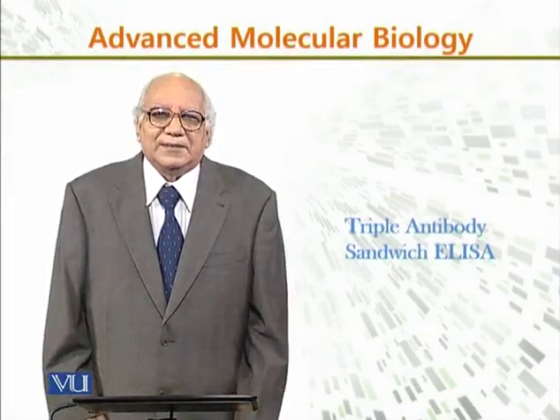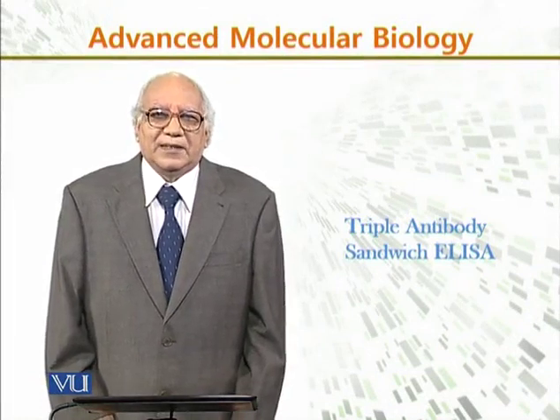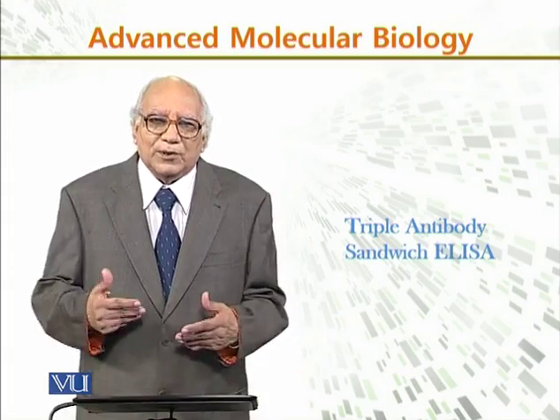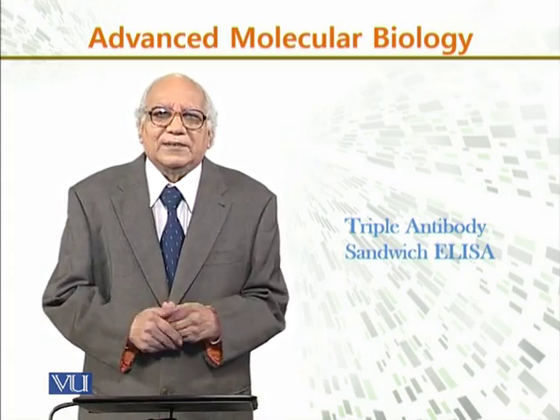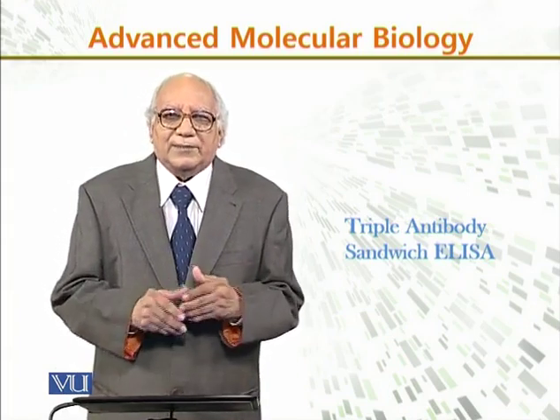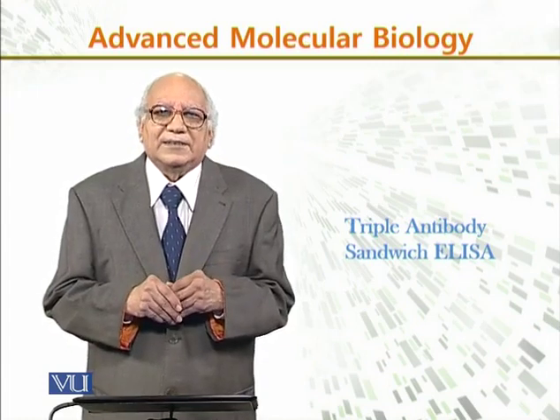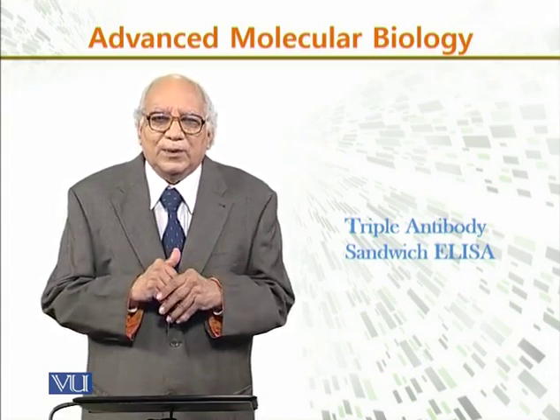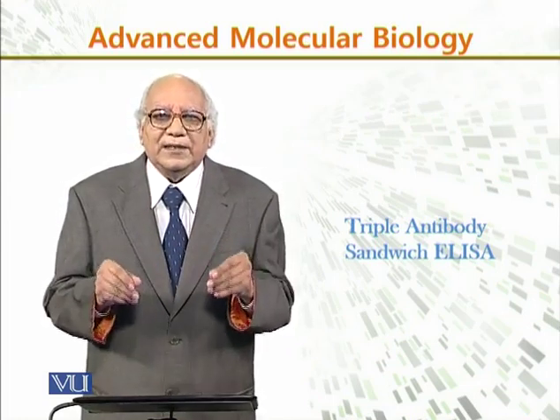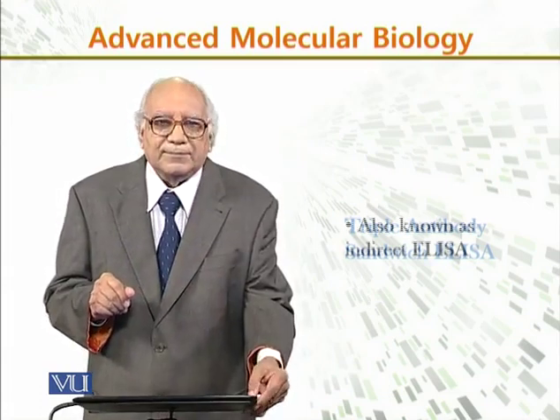Many methods for assaying the antibodies. In the previous modules, we have discussed a number of them. Today, in this segment, I will discuss another interesting method to assay the antibody, and that is known as the triple antibody sandwich ELISA method.